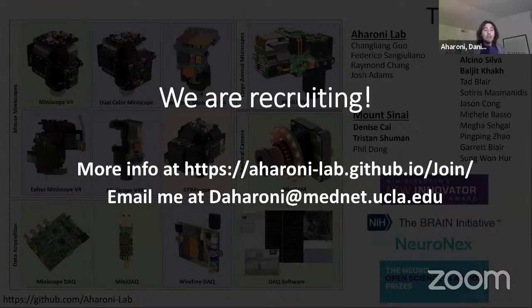And really, you don't have any motion of the Miniscope relative to the skull of the animal for a wired or wire-free setup. The motion you see is really the brain moving relative to the rigid skull-mounted miniature microscope. So I don't think stability of the system is an issue. If anything, it's better because you don't have a cable running off the animal's head for these wire-free setups.